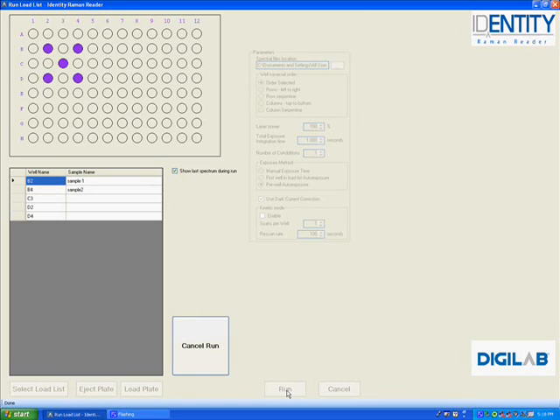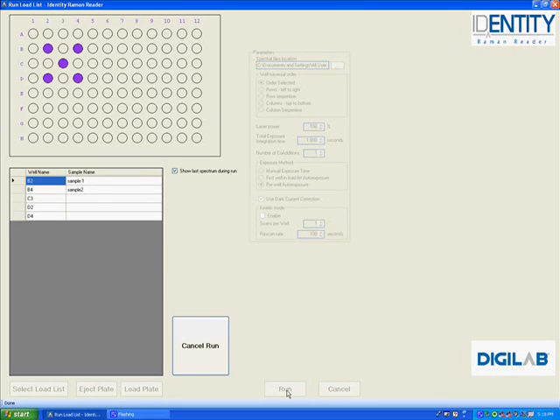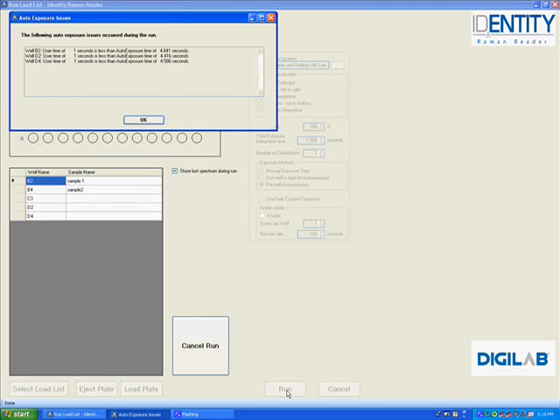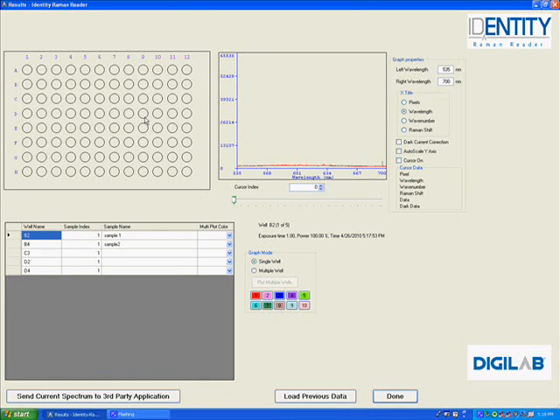Once the plate has been ejected after the plate scan, the software will automatically jump to the display results page where we can review results from the last acquired well scan.